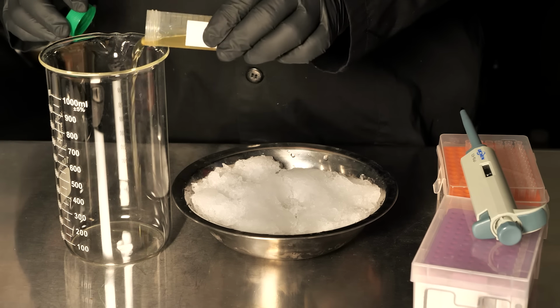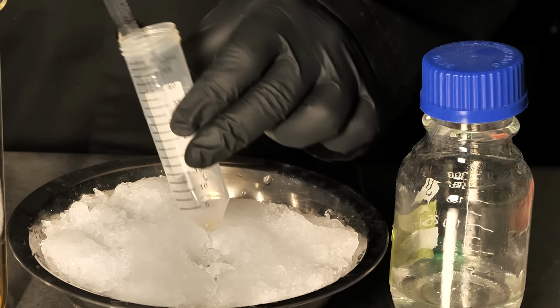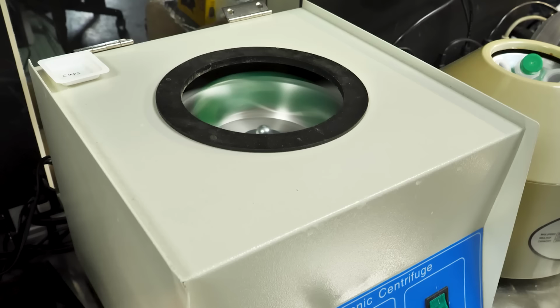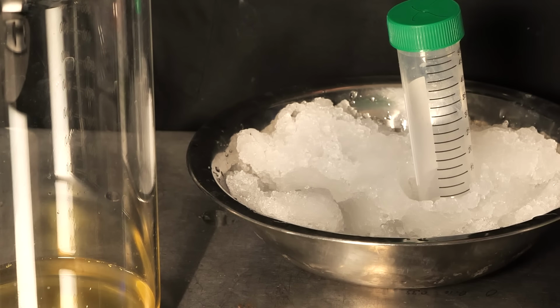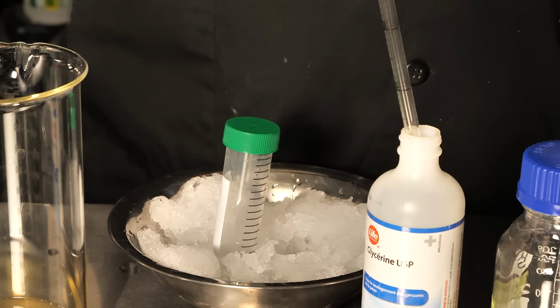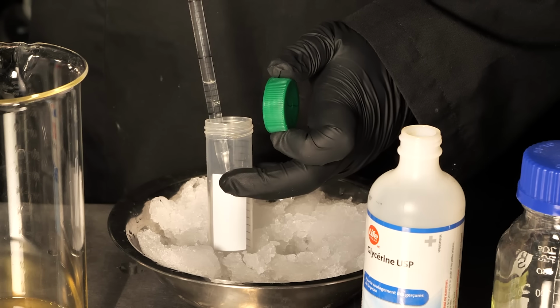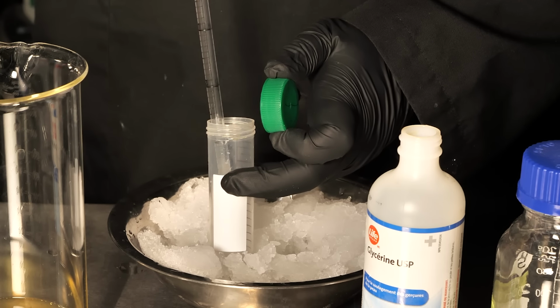We can then carefully dump out the LB and replace it with 10 milliliters of calcium solution. Everything is mixed by pipetting up and down gently, then it's all spun down again. We're once again going to replace the solution, this time with 8.5 milliliters of calcium. Because the goal of this is to have frozen tubes for later use, we add in 1.5 milliliters of sterile glycerol on top, which will act as a cryoprotectant.